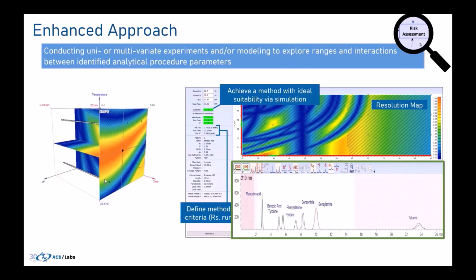In this case, you can see the green chromatogram is the experimental and the black is the simulated. Now they lie mostly on top of each other, which tells you that there's an excellent agreement between the model and the experimental data. Now, if the experimental data and the simulated chromatogram did differ, you could add the new experimental data to the model for additional refinement.